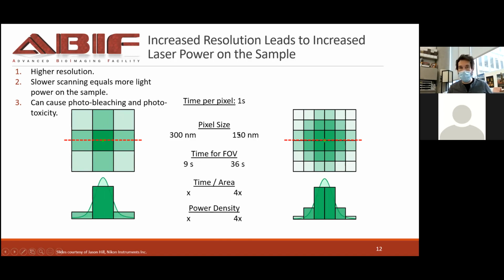And so you have the flexibility to choose between this, and of course we went from 300 nanometers to 150 nanometers, so we changed by half. You can make it slightly smaller, and you can increment this almost as much as you want. So it's important to think about this and really get the resolution that you need, and not simply the highest resolution possible if it's not necessary.